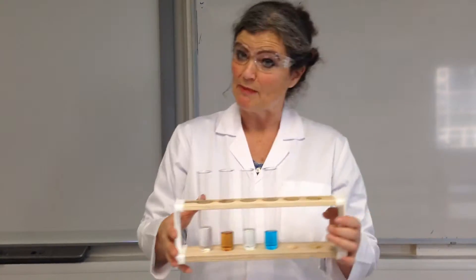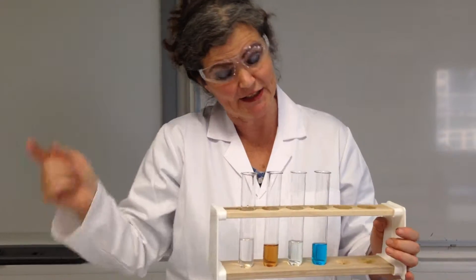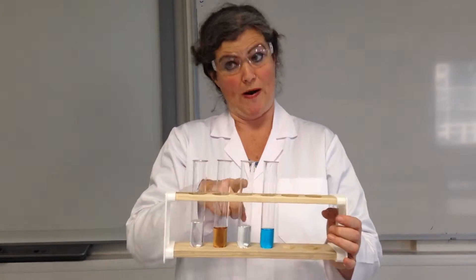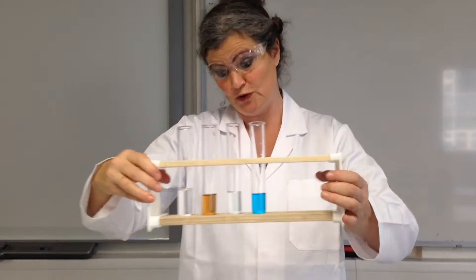Ionic compounds are made up of two parts: a positive bit and a negative bit. I'm going to add sodium hydroxide to these four solutions today. We've got copper ions, iron 2 ions, iron 3 ions, and calcium ions.